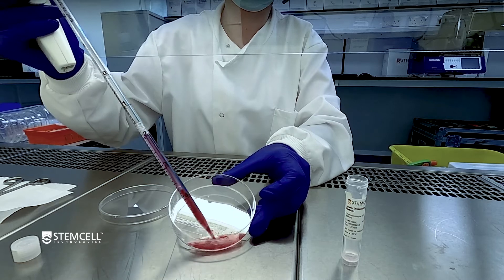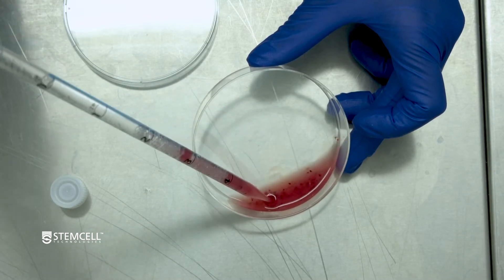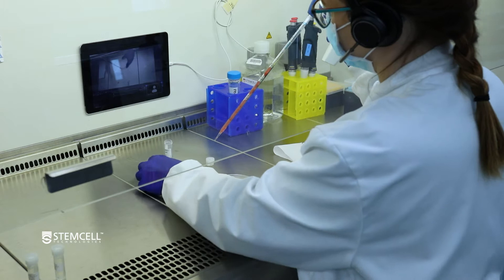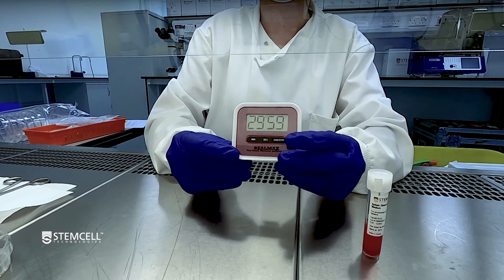Next, pour the contents of 1 vial of spleen dissociation medium into the dish and mix well by pipetting up and down several times. Transfer the suspended spleen fragments and the spleen dissociation medium back to the original tube. Incubate for 30 minutes at room temperature.